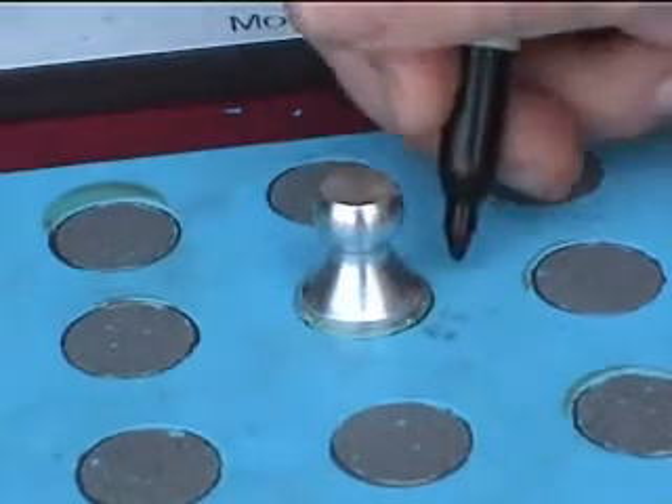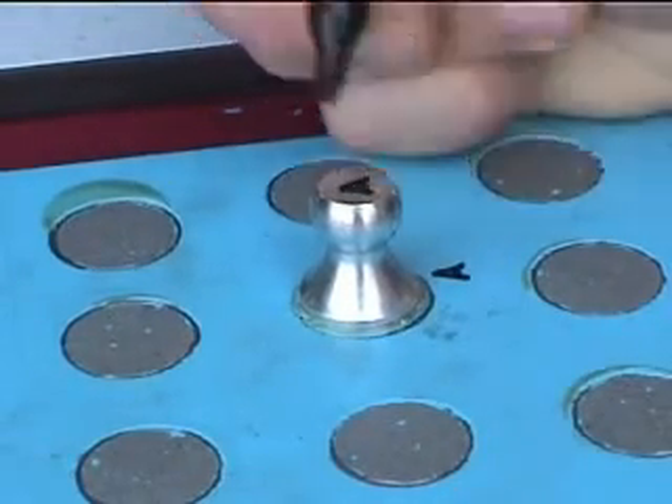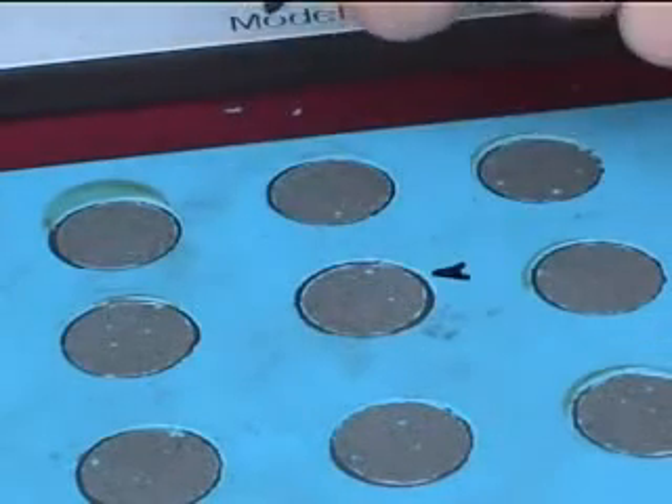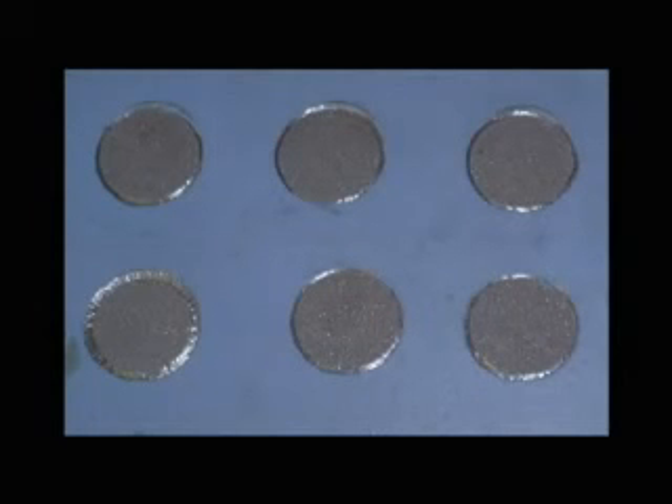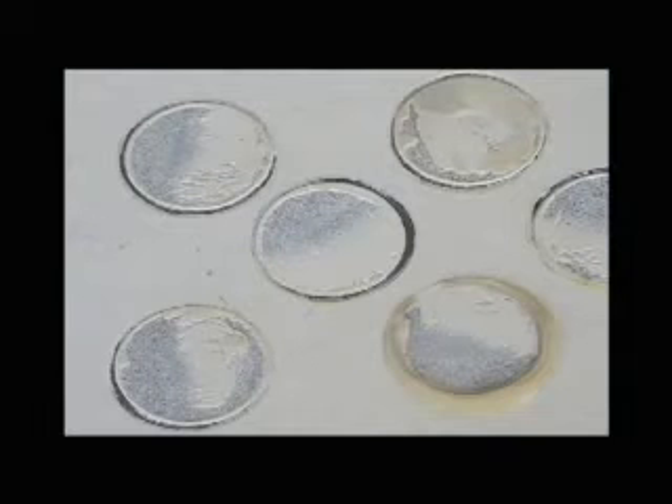Mark the dolly for future qualitative analysis. An ideal pull-off test removes 100% of the coating from the substrate or particular coating layer. Anything less may require both quantitative and qualitative analysis.